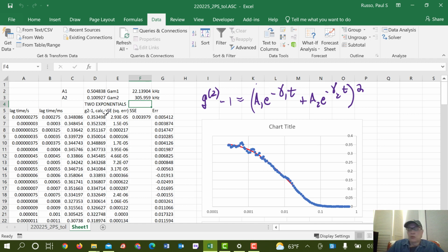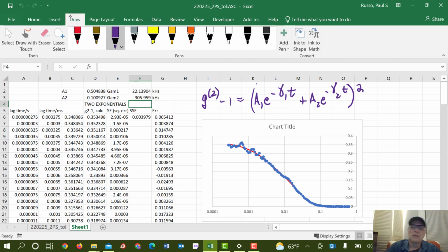With 2 exponentials only, that would suggest, if we believe that the distribution of this polymer is bimodal. But we shouldn't believe this. Okay, so this is my decay rate gamma, and these are my amplitudes as a function of gamma.